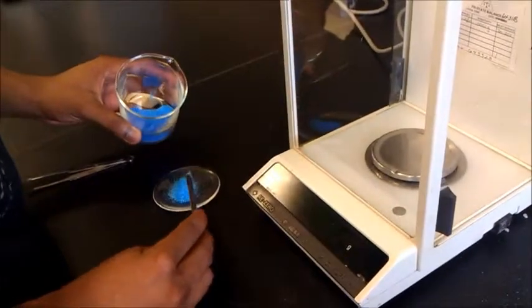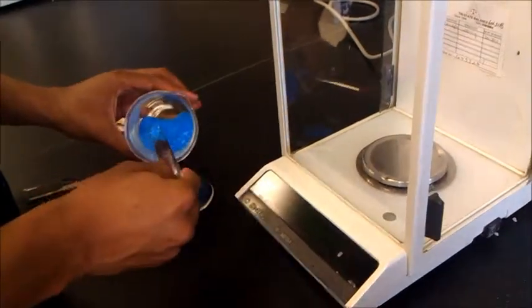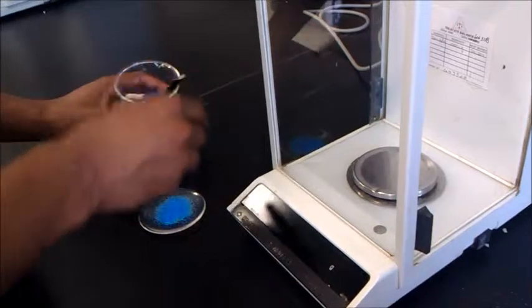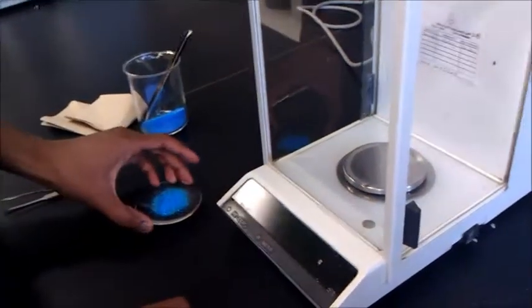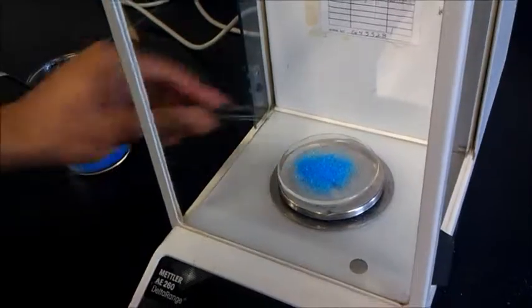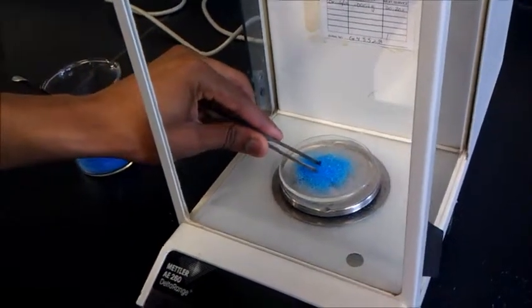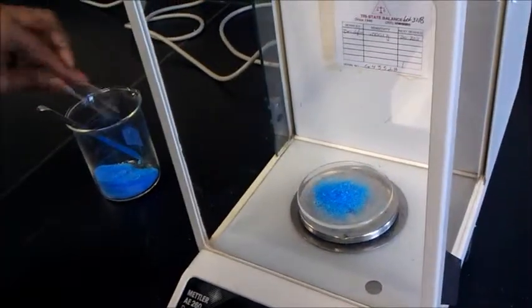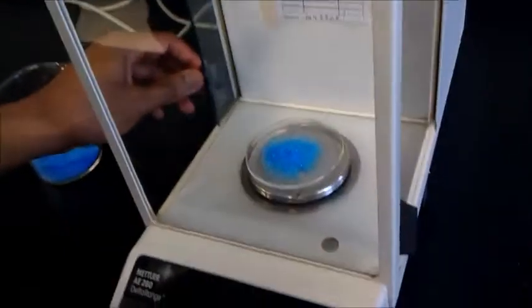Having zeroed the balance with the watch glass on there, Herbert will now remove the watch glass and add on the blue solid. With the blue solid on the watch glass, Herbert will place the watch glass onto the balance and then measure it to the nearest hundredth, since the thousandths are constantly fluctuating due to air pressure.